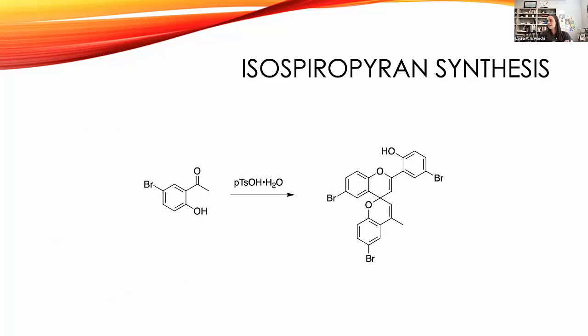So this is the reaction that we're focusing on in this lab. In the literature, slightly different reagent conditions were put together, but we were looking at this interesting, as a dye chemist, right, this interesting colored molecule that we made that had all kinds of properties, and really through simple acid catalysis built up this somewhat complex structure. So for the students, I try to simplify things a little bit and show them where it all comes from, right? So 3 equivalents of that starting material end up in the product.